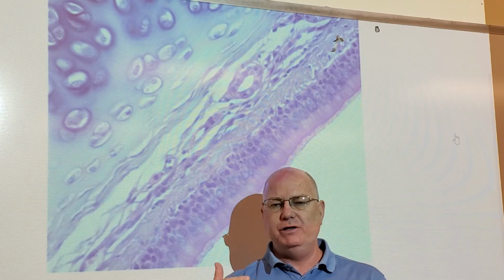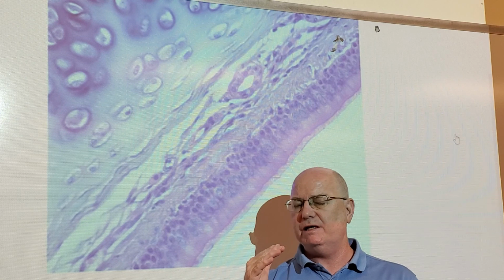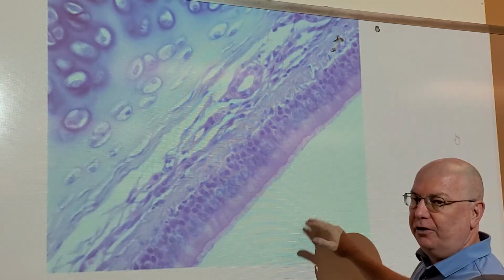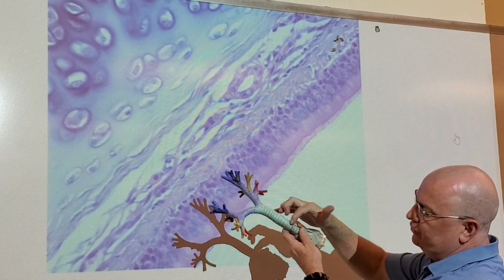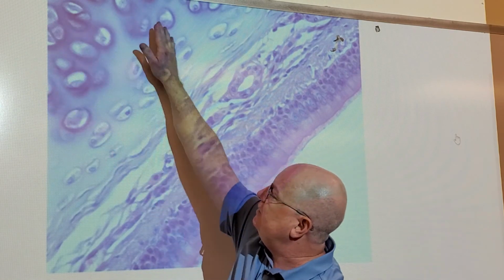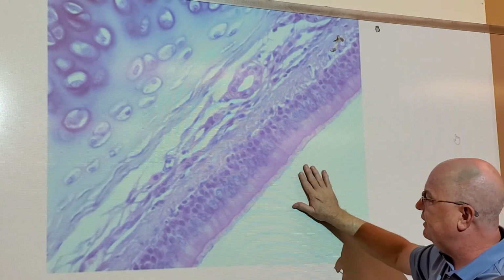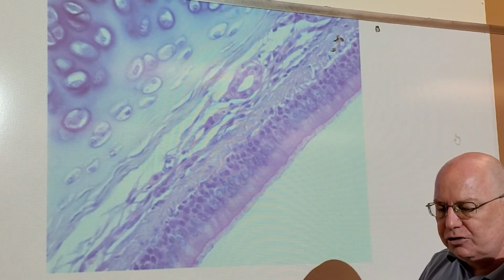Always and forever underneath the epithelium is a basement membrane, and almost always a connective tissue. Well, this would be our epithelium because this is where air would be flowing. It's as if someone were lying like this, and I can see the tracheal cartilages here, which would be this piece. So there would be skin, some connective tissue, cartilage, connective tissue, and epithelium, and then the air would be flowing down the tube. I hope that gives you some perspective.